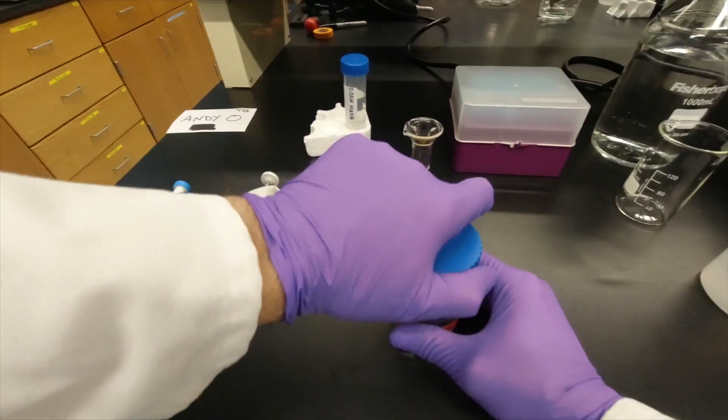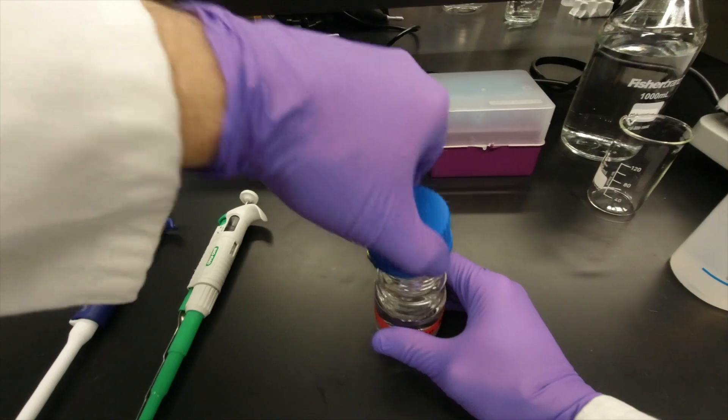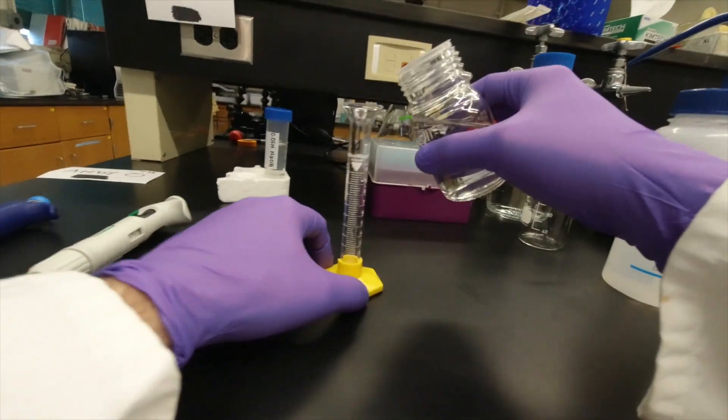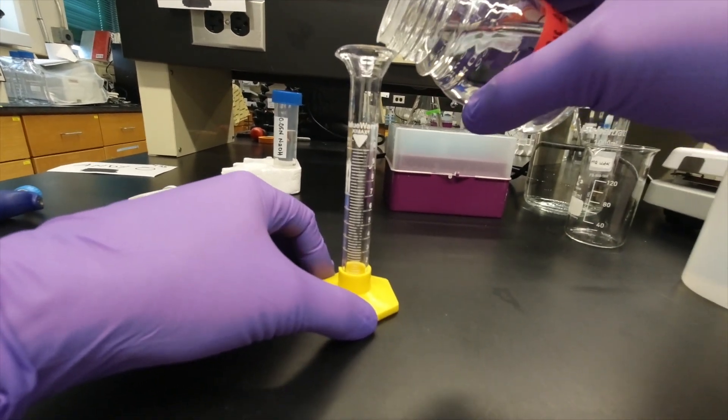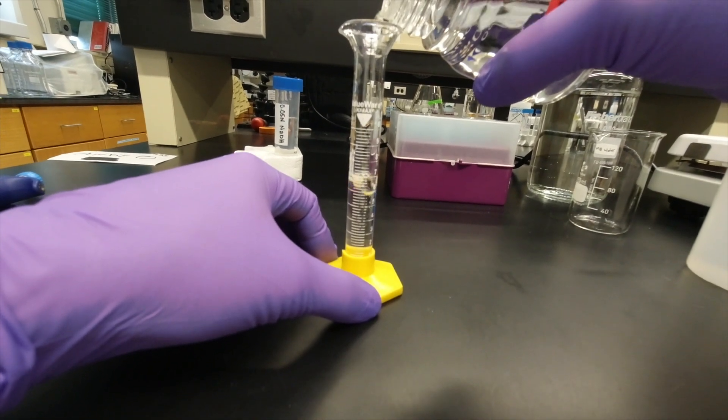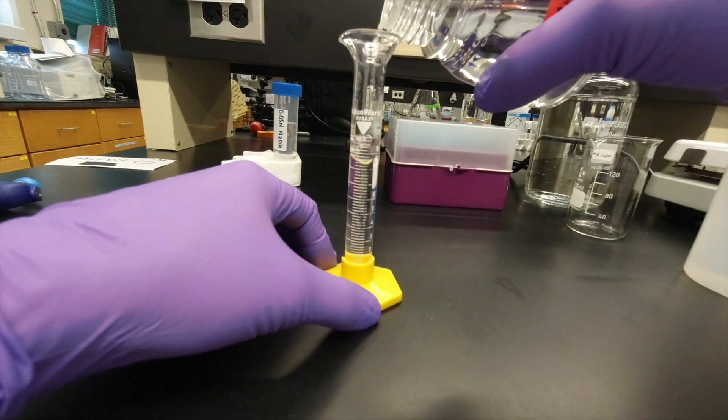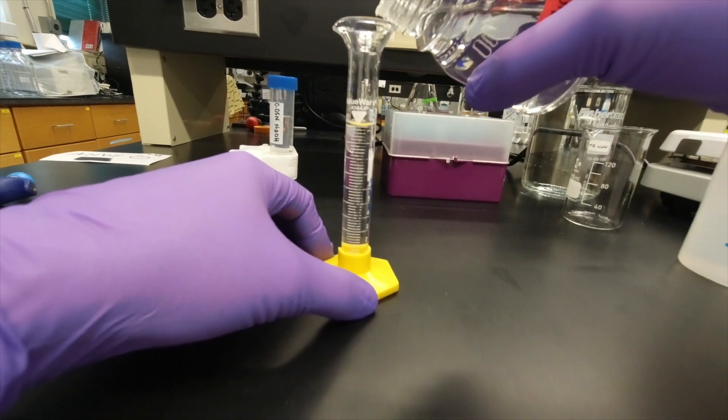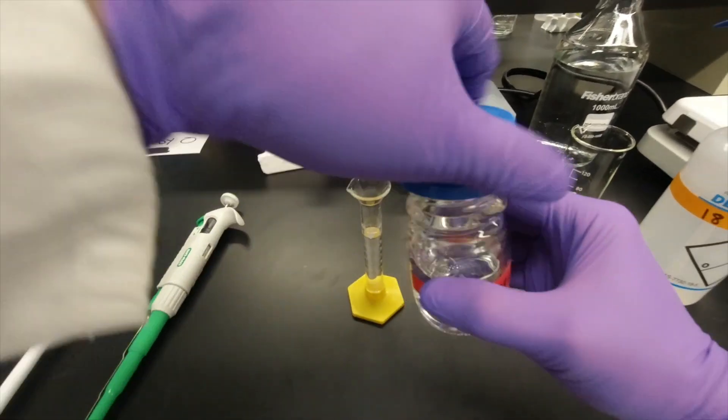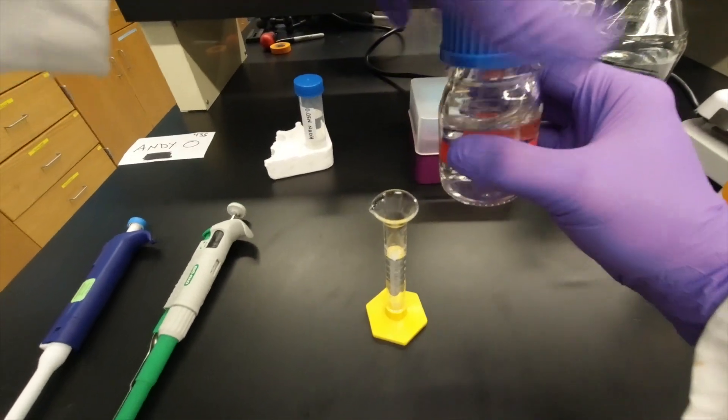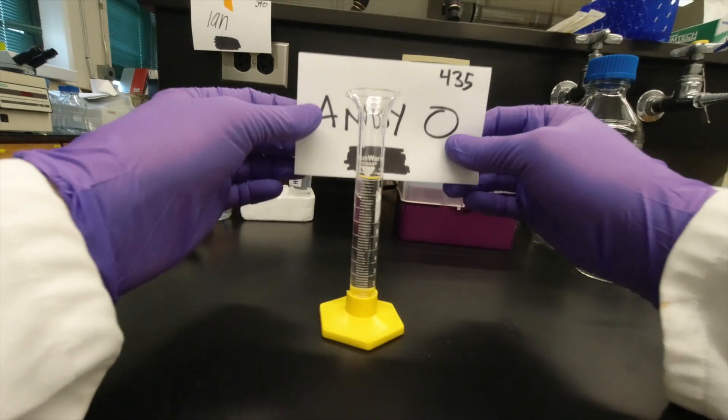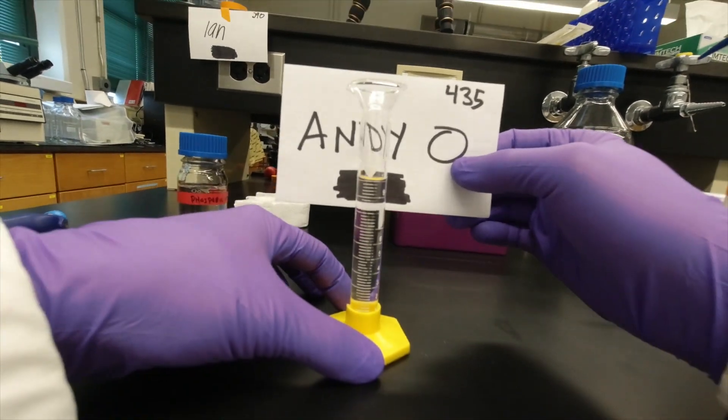So for the phosphoric acid, you want 10 milliliters. And so to get exactly 10 milliliters, you're going to look at the meniscus here. So can you see the meniscus?